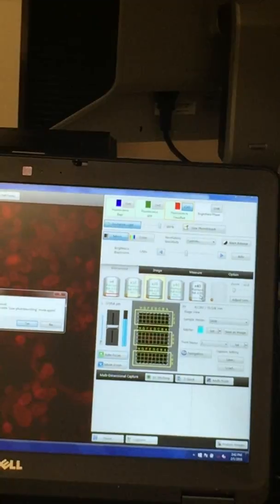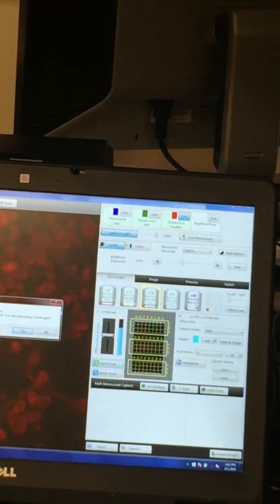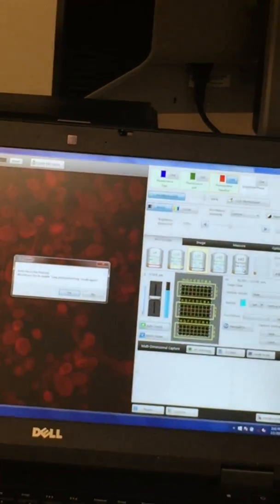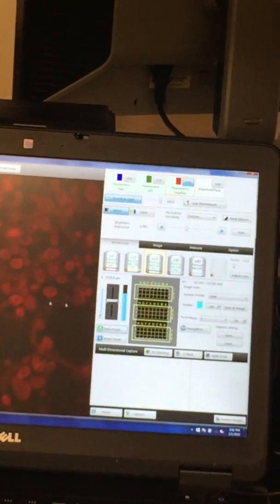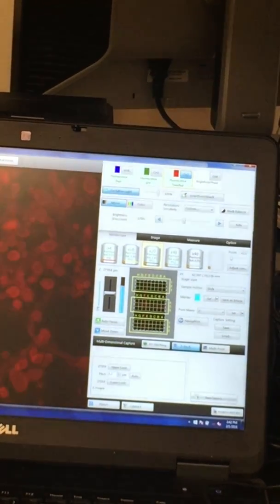If you guys really want to get involved in the different magnifications, I can show you how to put in another magnification in the microscope, and it's pretty much the same workflow for all the different objectives. But it's just one thing to keep in mind when looking at objectives for the system. So what I'm going to do here is turn on Z-Stack.